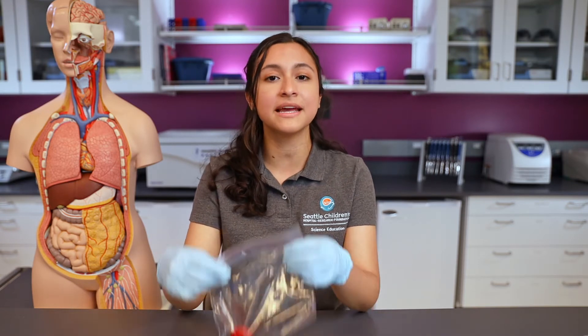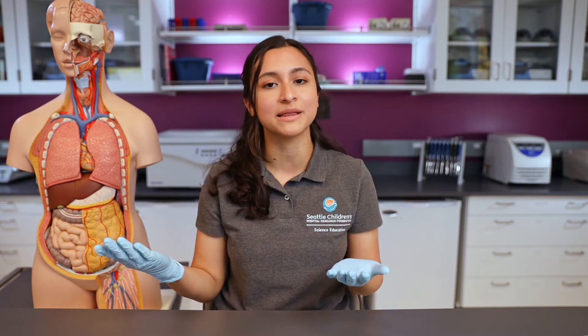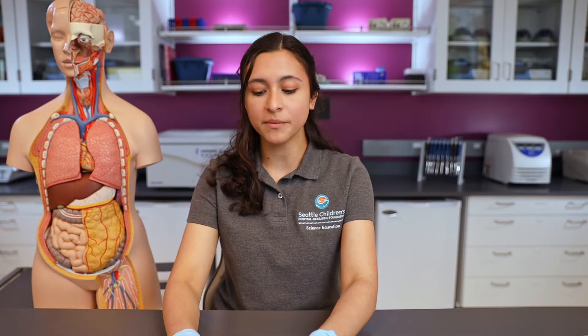Today we're going to do a DNA isolation experiment with a strawberry. We will provide the protocol so you have all of the steps and materials you need to do this experiment yourself with the help of a parent or guardian. You can also use a banana if you have that available, and everything we're using is completely safe — I'm just wearing gloves because I'm in my laboratory today.